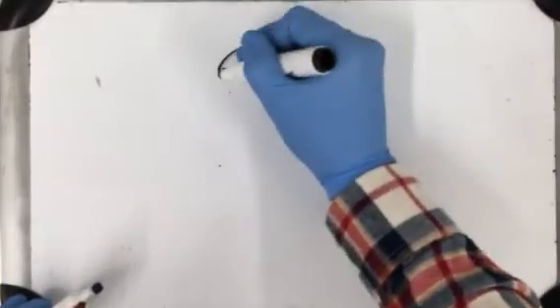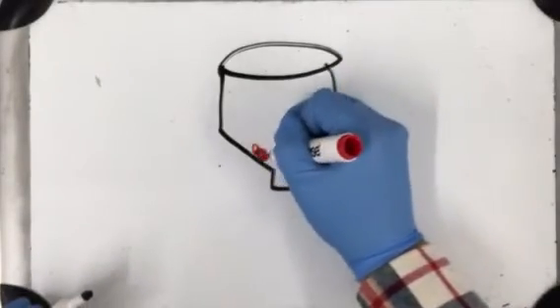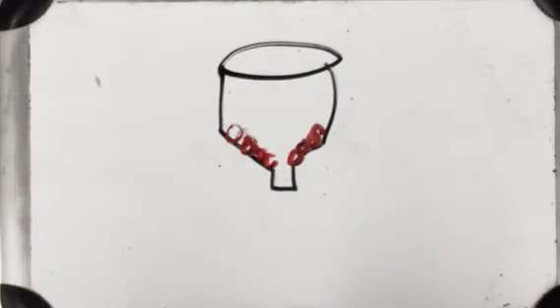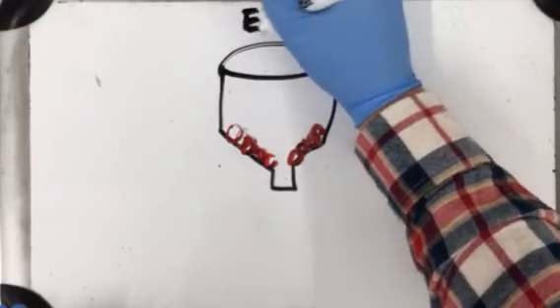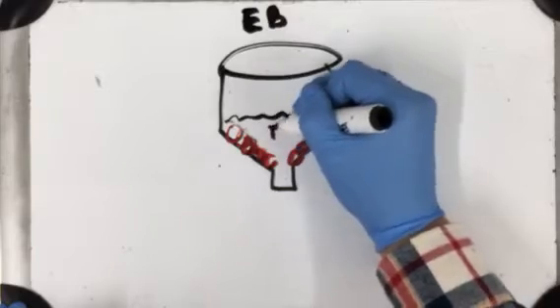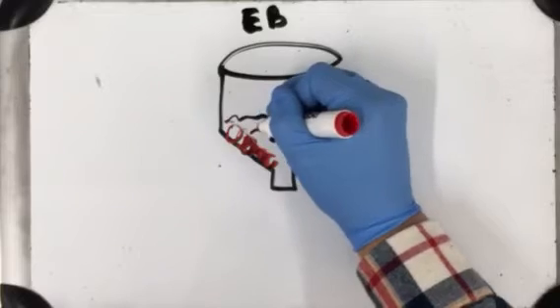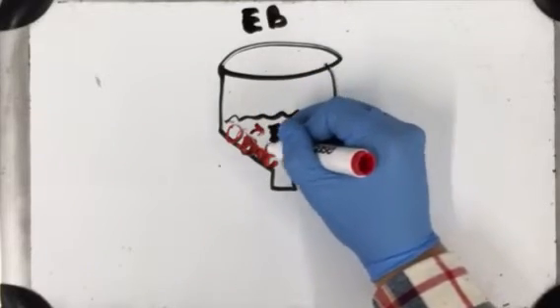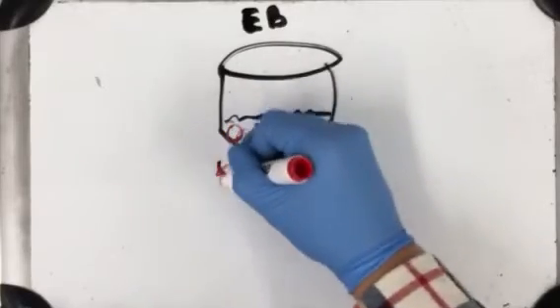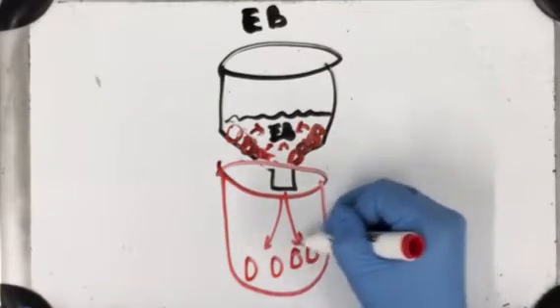So we're at this stage, and we've washed a couple times. We've got tons of plasmid just waiting here. The last step is what we call EB, or elution buffer, because what you'll do is fill the spin column with EB, and what that does is disassociate the plasmids off the filter. And now we would replace that old collection tube with a new tube that's just for plasmid, and we'll do one more spin.